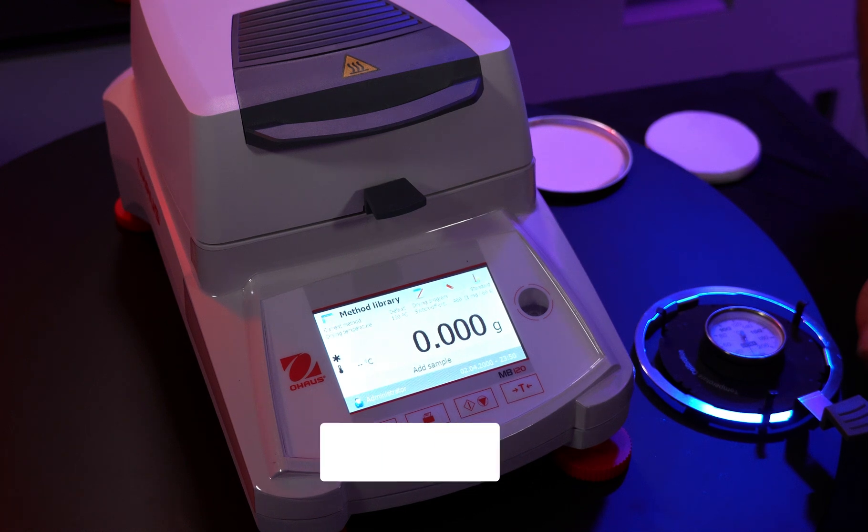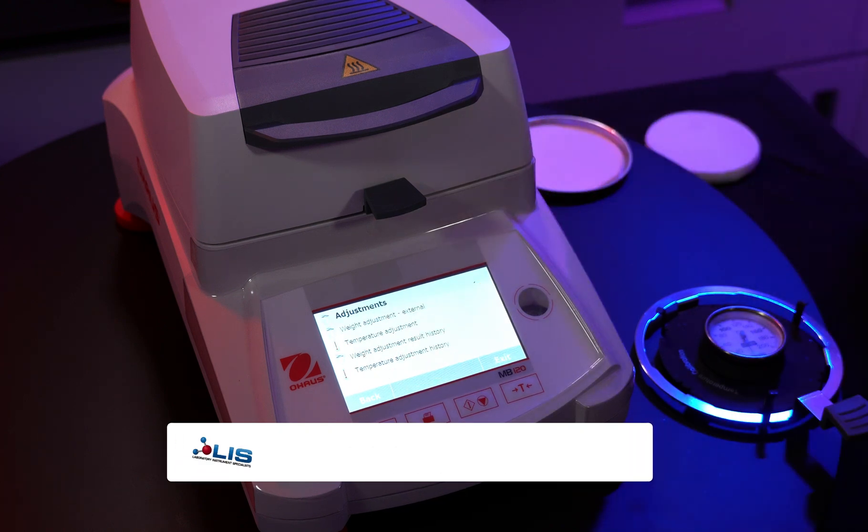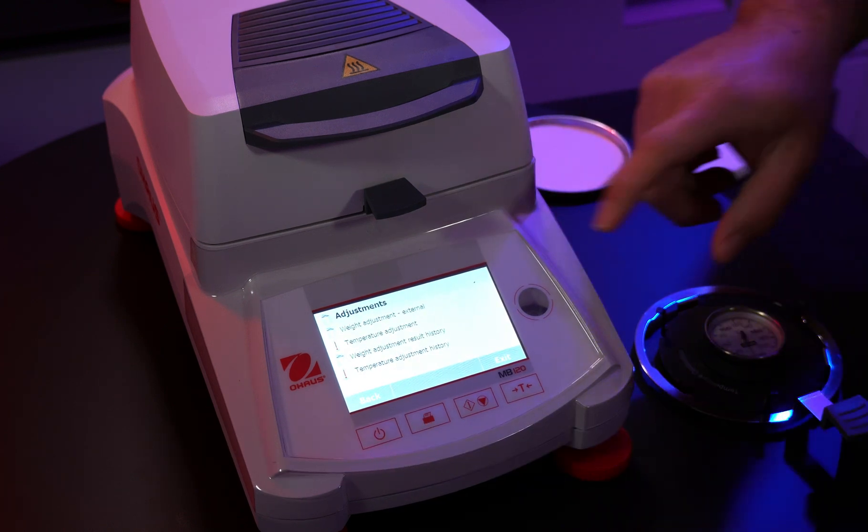For the temperature calibration, we'll do the same thing by going to the settings menu. Go into adjustments. This time we want temperature adjustment.